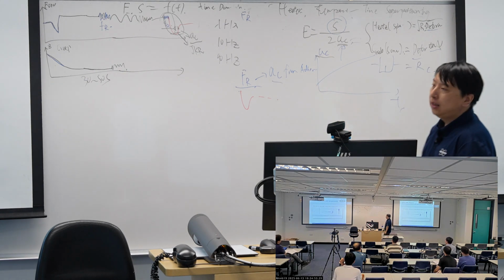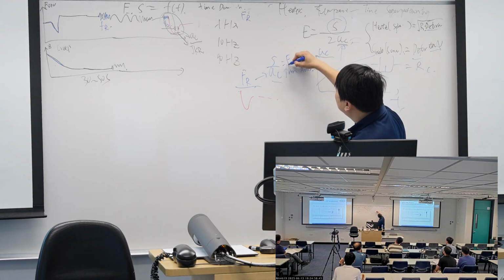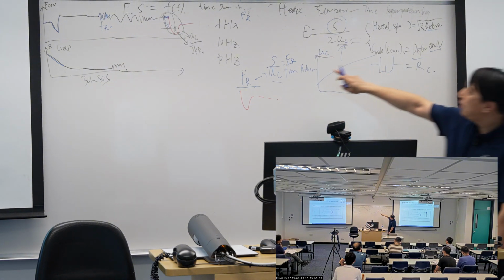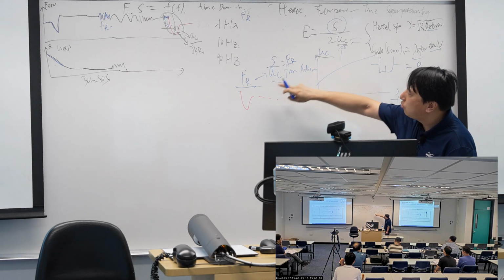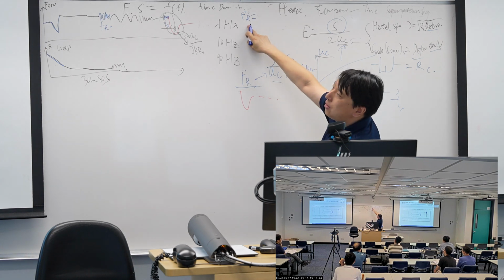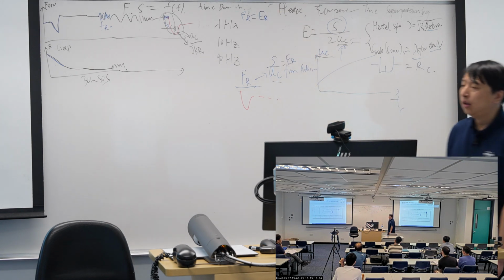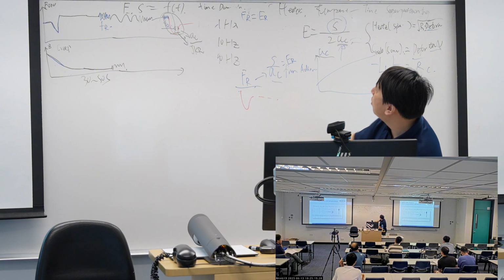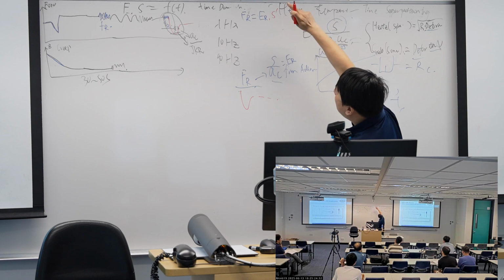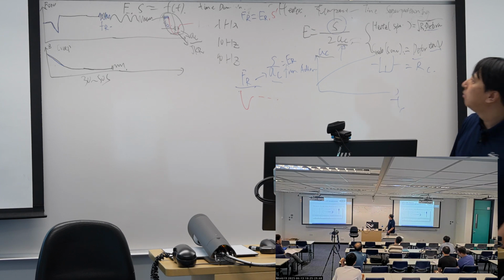And at this AC, I have the stiffness, so I can get the modulus at the reference frequency. The modulus at this reference frequency should equal the modulus at the reference frequency at the beginning. At the beginning, I can also get stiffness. The stiffness at the beginning and at the end may not be the same because the radius is not the same.